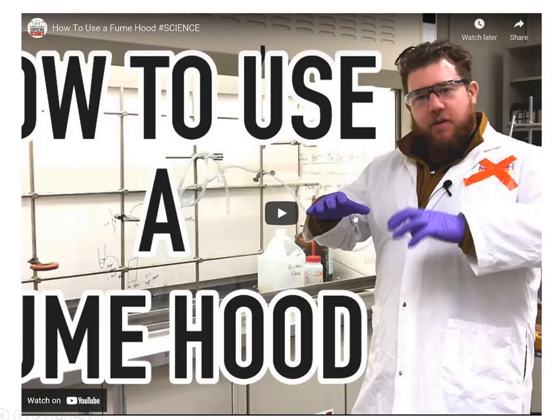Okay, let us watch this video to get a picture of how to use a fume hood.